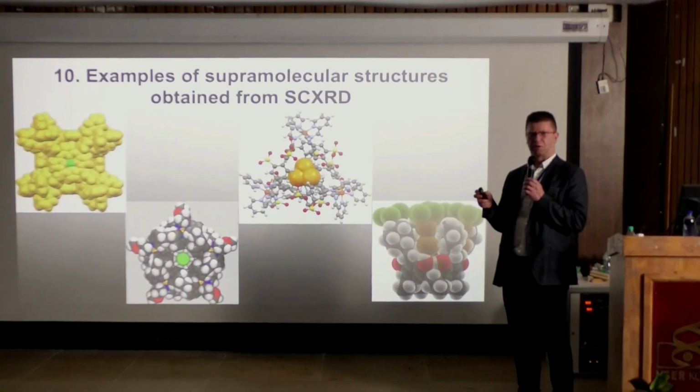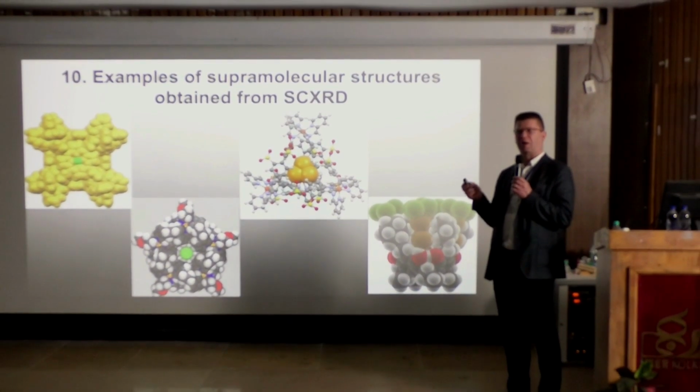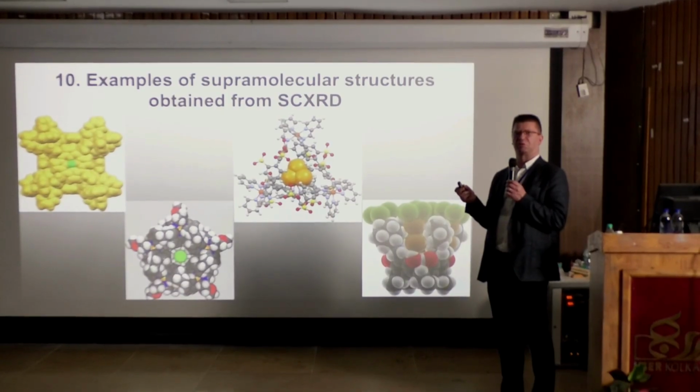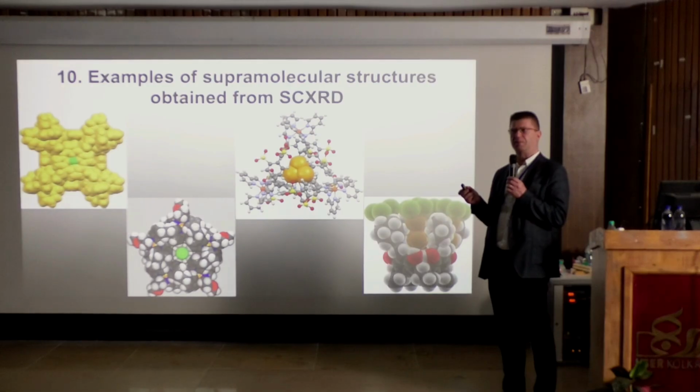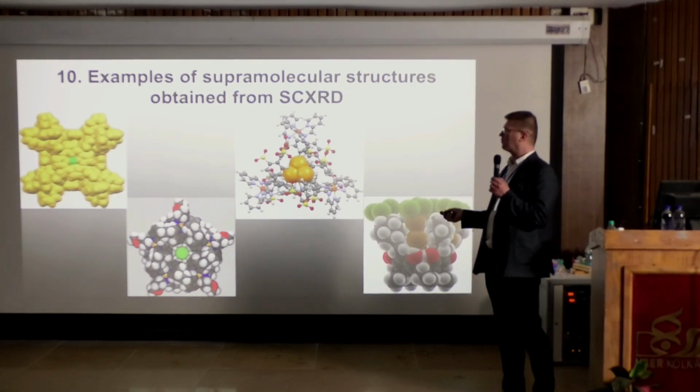Then they are showing you examples of how, and into which kind of research, you can use, or we have used, single crystal X-ray diffraction. Remember, everything comes from the fact that you have to have the crystal. And once you get the crystal, then you have a high chance of getting the structure, even a very complicated structure. When you see it in a paper, you might think this will never crystallize, you will never get the structure. But I will show you examples.